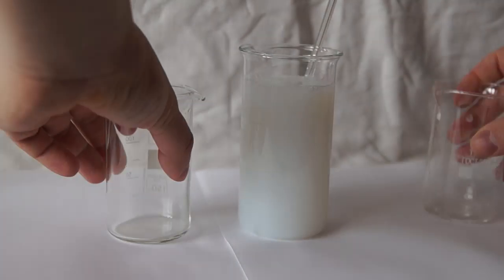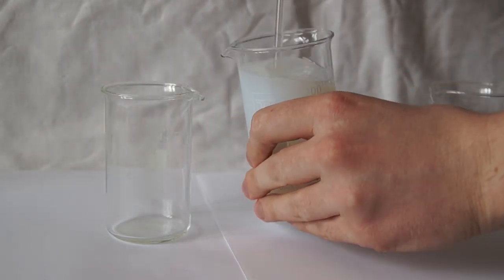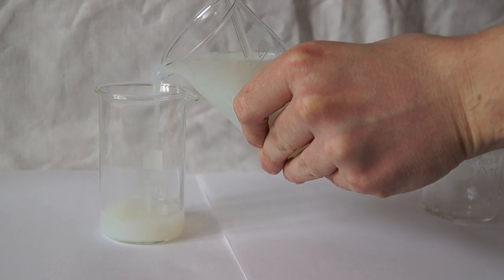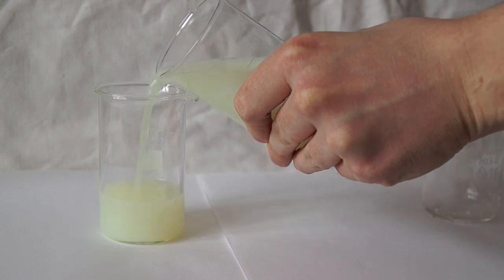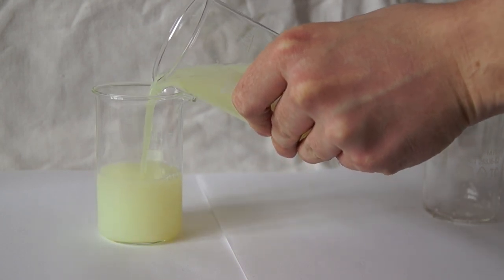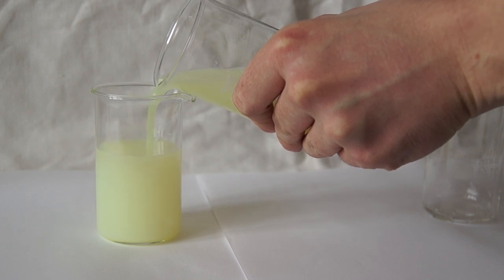And now we will try to pour this solution into another cup and see how the color will change. Here you can see that the solution first turns white and then it gradually turns yellow.